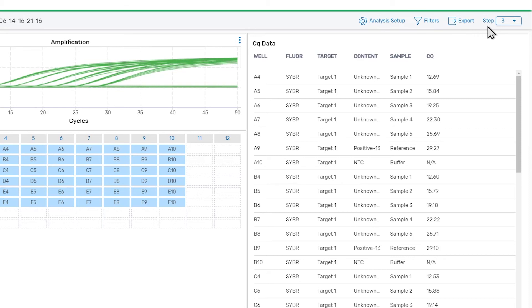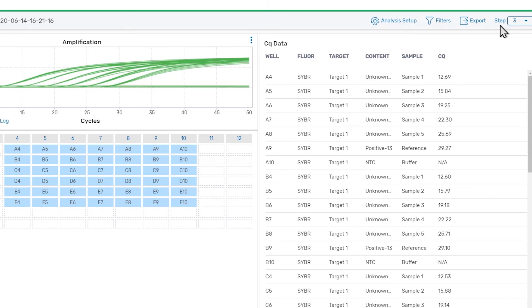This last item is not something that you'll need to use for typical real-time PCR experiments, as it is only needed when a run contains multiple amplification steps.